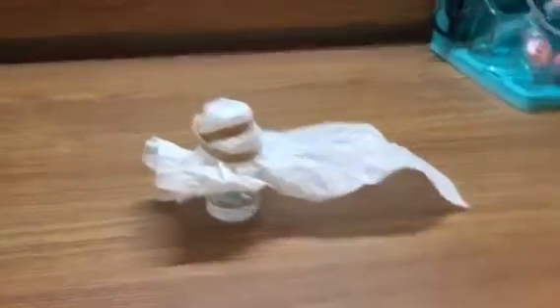Good evening, everybody. It is currently 8:13 p.m., February 22nd, 2018, which means it has been four or five weeks since we began this experiment. Okay, so let's take a look at the crystals. It's about a month into the experiment.